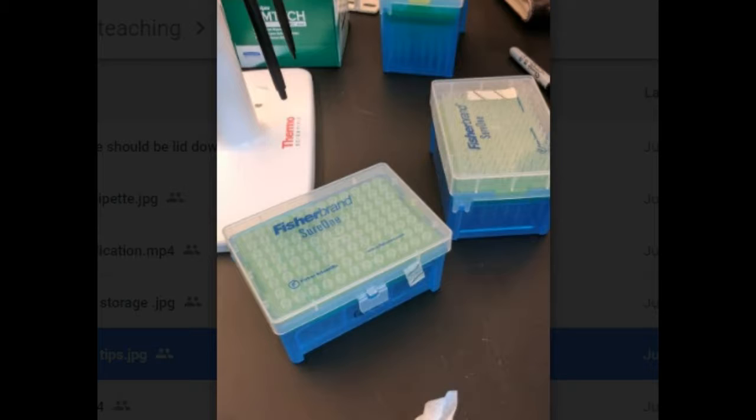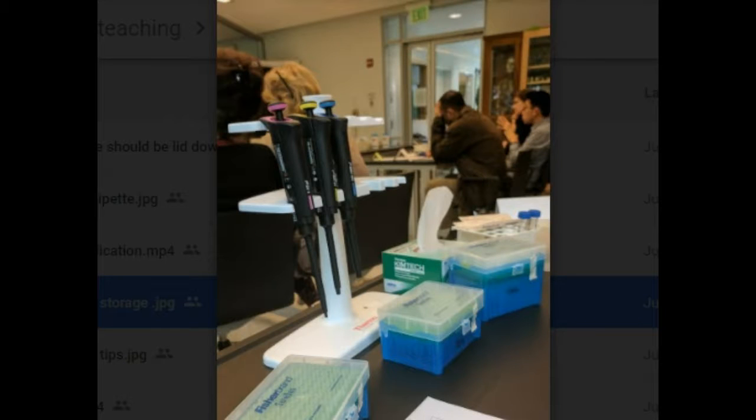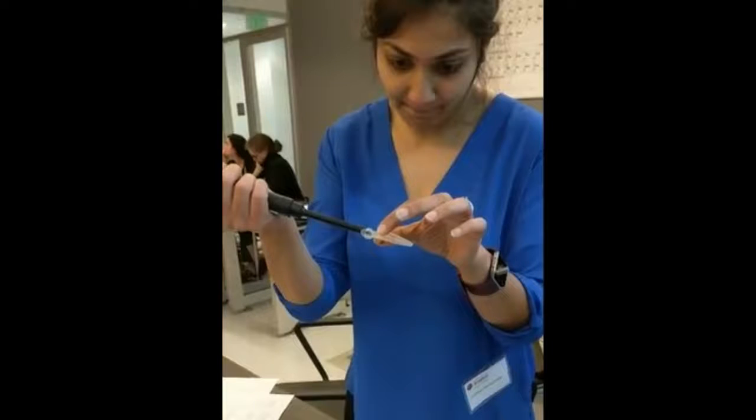You never use a tip twice, you just use it and then you discard of it in the cup that's on your lab bench. And when you're not using the pipettes, you should put them into this stand. These things are pretty delicate, okay? And so there's a stand, there's plenty of places for different ones. The reasons why we use more than one is because they are appropriate for different volumes of liquid. But never just set it on the table. It's best to put it right back in the rack so it stays clean and doesn't get broken.